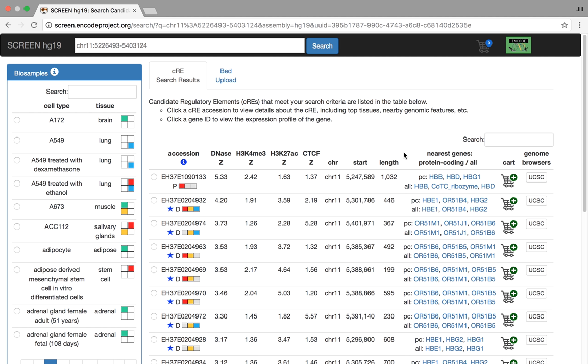Here are all the CREs in that region that meet certain thresholds we specified. First off, all of these candidate regulatory elements have a DNase Z-score greater than 1.64. So basically, we've taken all the DNase sites and we've sliced the top 5%. These are the CREs with the strongest DNase Z-scores.